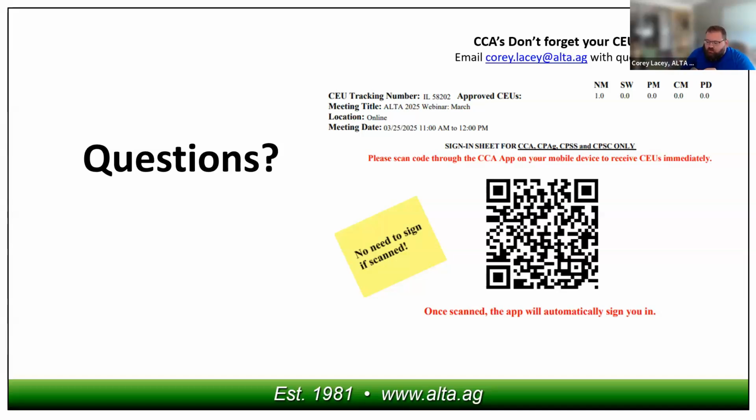Right. So the question that was asked is, do you recommend using an internal standard with very rapid soil analysis? And so can you expand on that a little bit? I would prefer running internal standard all the time. I don't know that there would be a speed advantage to running without internal standard.